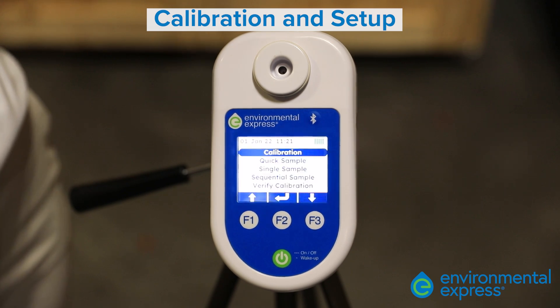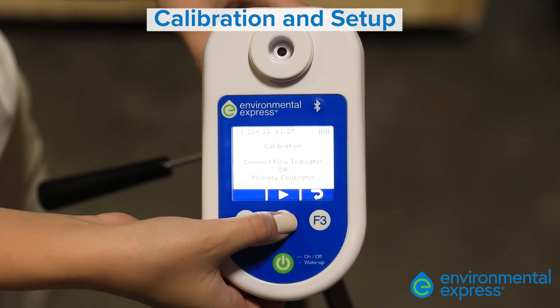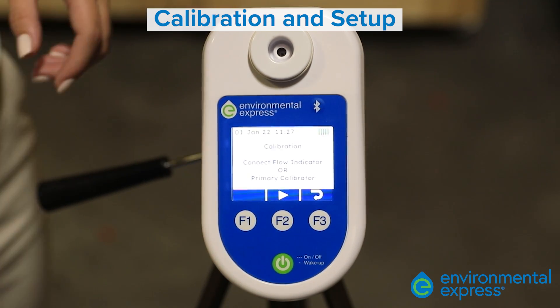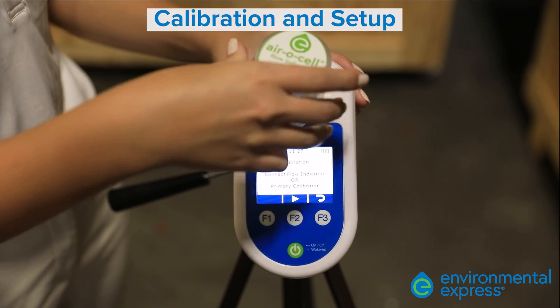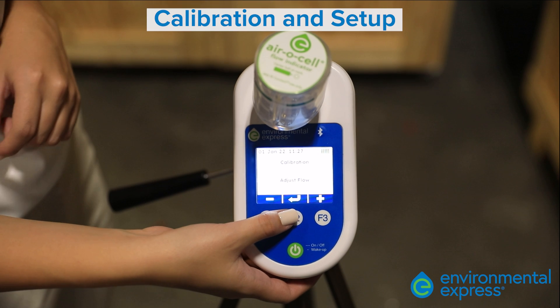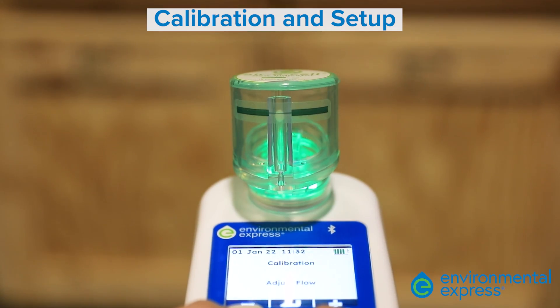On the home navigation screen, verify that the battery is fully charged before you take your sample. Select calibration from the home screen by pressing the middle button. The pump will prompt you to connect the flow indicator or primary calibrator. Place the aerosol flow indicator snugly on the pump and select calibration from the nav menu. A green indicator light will appear. Use the arrow keys to adjust the flow position of the ball in the middle of the flow line.